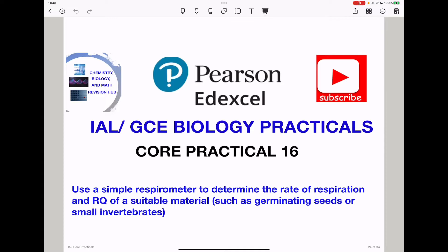Today we are doing the Pearson Edexcel International A-Level as well as GCE Biology Practicals. This is Core Practical 16. Use a simple respirometer to determine the rate of respiration and RQ of a suitable material, such as germinating seeds or small invertebrates.